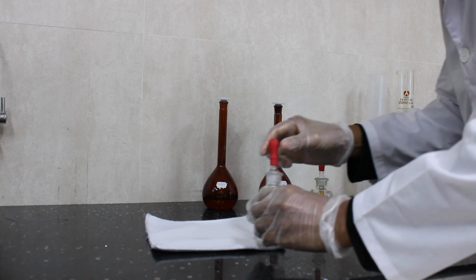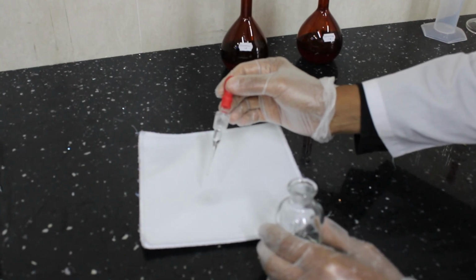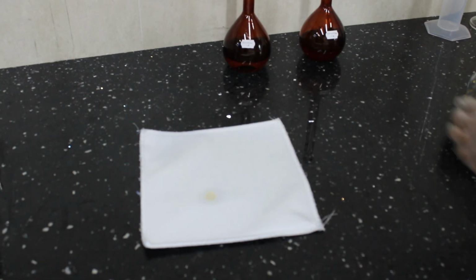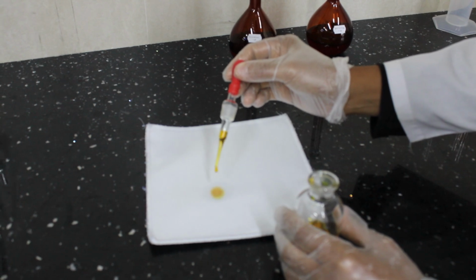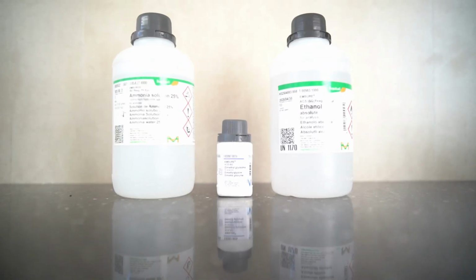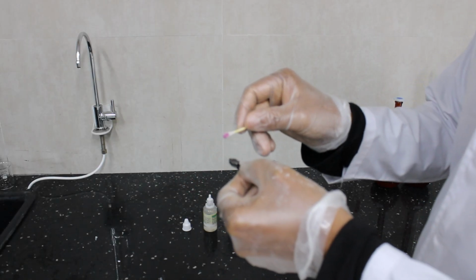Formaldehyde spot test. The purpose of this test is to determine the actual concentration of formaldehyde in the product. Formaldehyde is a highly toxic biocide which can cause severe burns and result in death if swallowed, inhaled, or coming into contact with the skin. Nickel spot test. The color change indicates the presence of nickel.